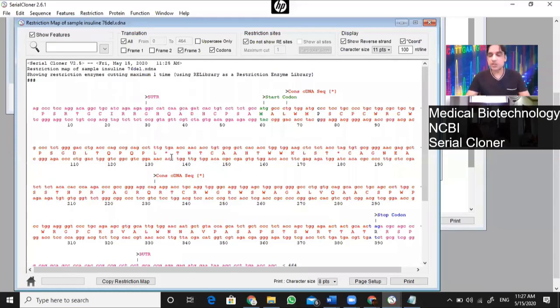One base pair change. I request you people to change one base pair, then two base pair at one location, then other location, add one base pair, add two base pair, add three base pair at one location and the other location, and see what happens. Okay, you will find many interesting things out of it. Do not do this for any course. Do it for yourself to see if you're able to find some more interesting thing out of it or not.